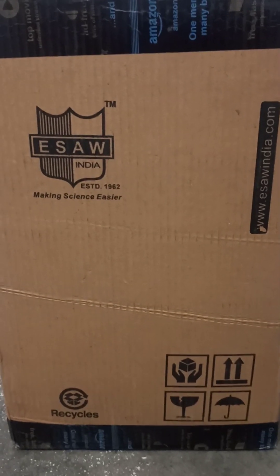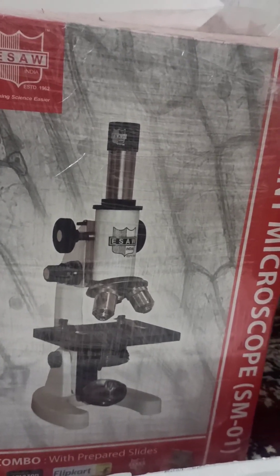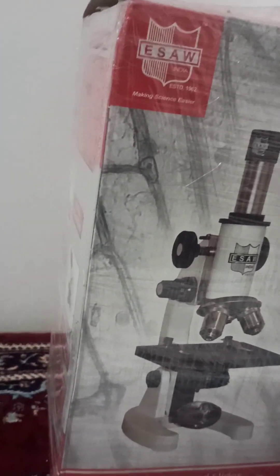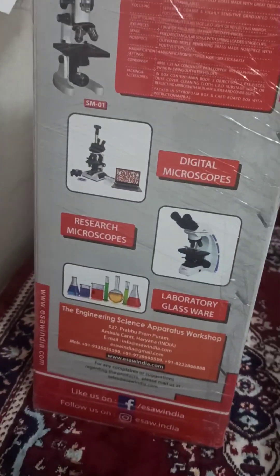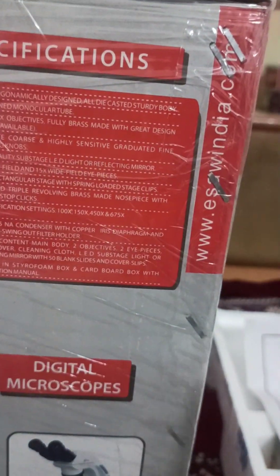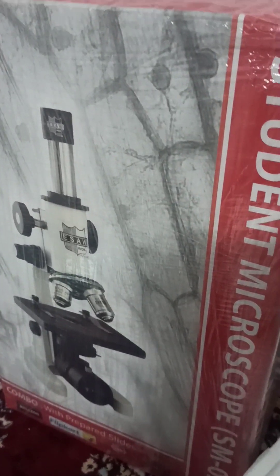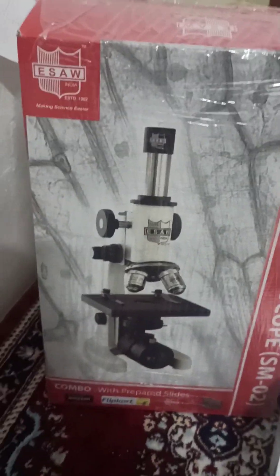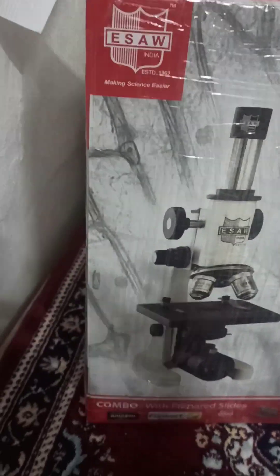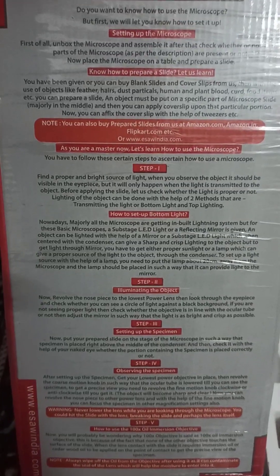This is the booklet that came inside the Amazon packaging box. It has some kind of instructions about the specifications and all. Anyone who is a curious student, just like me, can buy this from Amazon or Flipkart. It comes in an affordable price range and is very worth it.